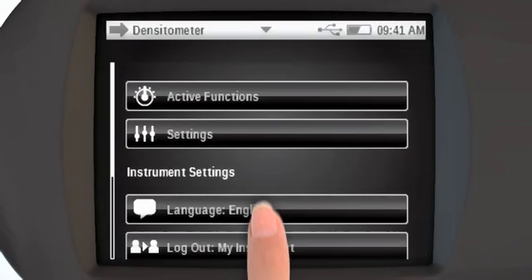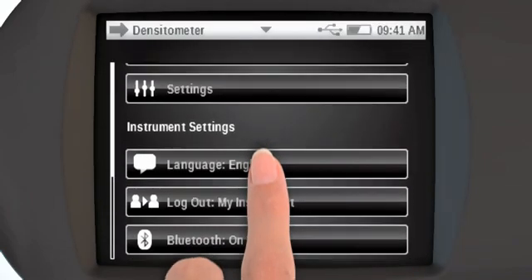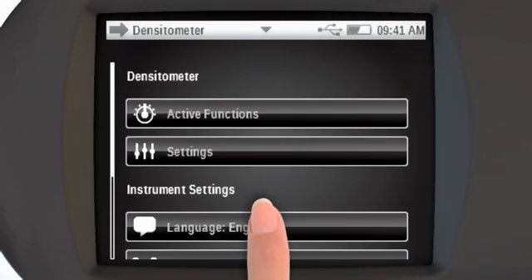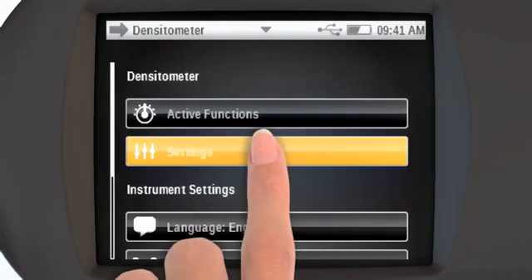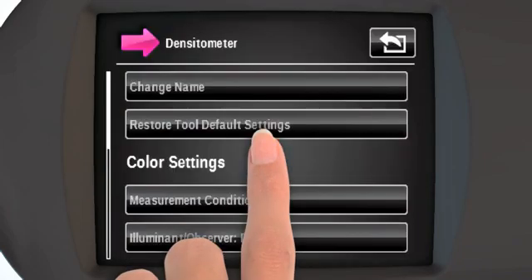Then swipe up and down to see all of the options that can be configured. Tapping on an item opens additional windows for configuration.